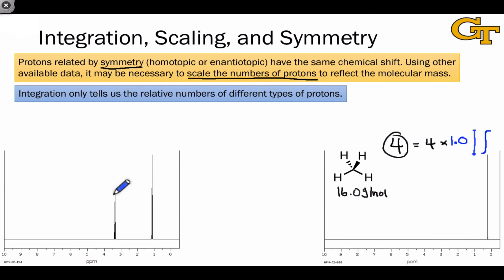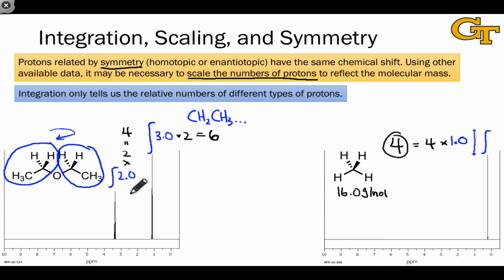Here's another example with peaks that look similar qualitatively to the ethanol peaks that we saw on the last slide. In this particular case, we would observe an integration of 3.0 for this peak around 1, and an integration of 2.0 for this peak around 3.5. This suggests some kind of formula like CH2CH3, but in fact, this is actually a spectrum for diethyl ether, which has that CH2CH3 fragment twice. And those two fragments, which I'm circling here in blue, are homotopic since we can simply rotate the molecule around like this and exchange those fragments. And so here again, we need information about the molecular mass or molar mass or molecular weight in order to scale these appropriately, multiplying each by 2 to get to the actual number of hydrogens of that type in the molecule, which in this case is six methyl hydrogens and four methylene hydrogens, organized in two groups that are related by symmetry.